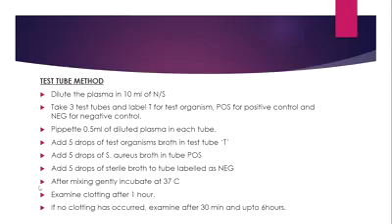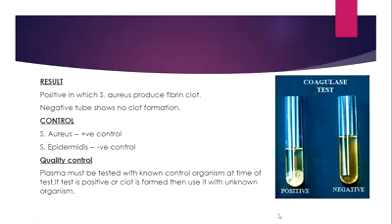And then we're going to mix all of them and incubate them at 37 degrees Celsius for about 1 hour. And after 1 hour, we're going to look for any clotting. If we don't see any clotting, then again we're going to incubate it, and after every half hour we're going to examine and look for clotting. This is to be continued for about 6 hours. And if we see a clot formation after all the 6 hours that we have completed, the test is going to be positive. As you can see, here we see the clot formation.